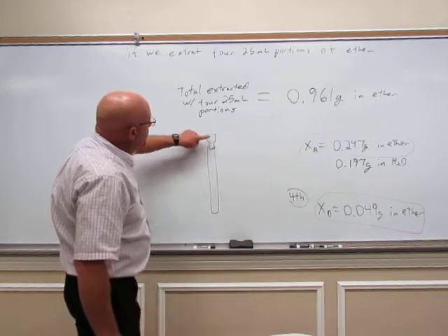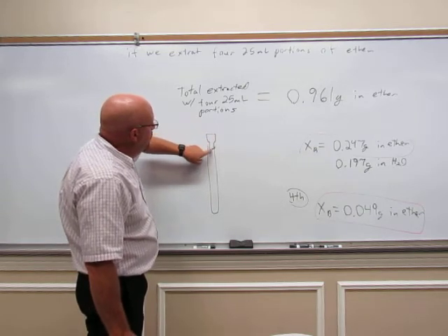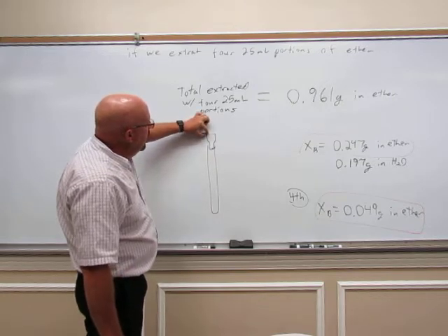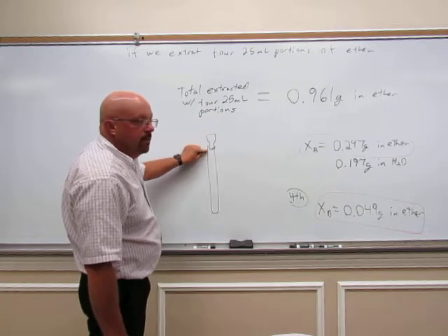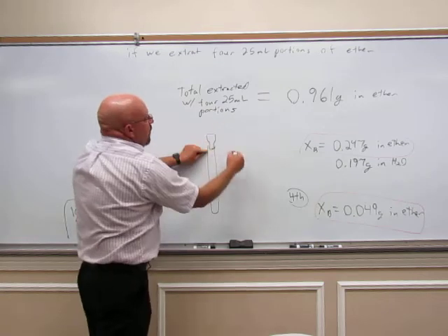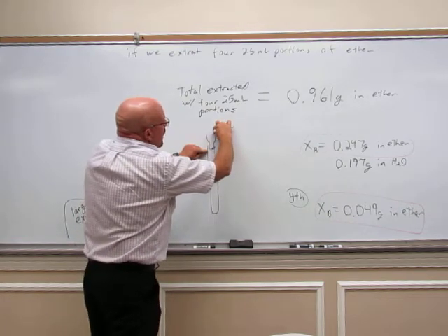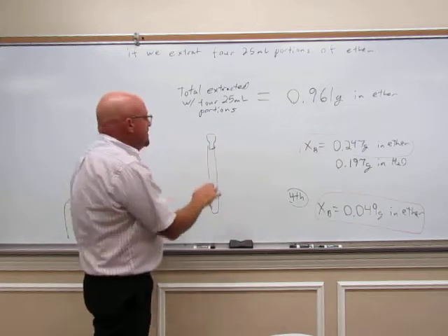Okay, so the septum is white. You've got a small end and a big end here. Put the small end down in the reaction tube. And then you're going to take the edge of this with your fingers and pull it over and hold it. You take your other fingers on the other side. This is rubber, this stretches, and you can flip it over on the other side. So it makes a good seal around this.